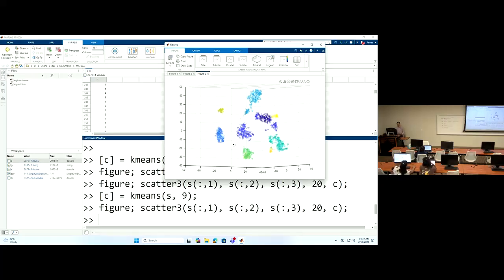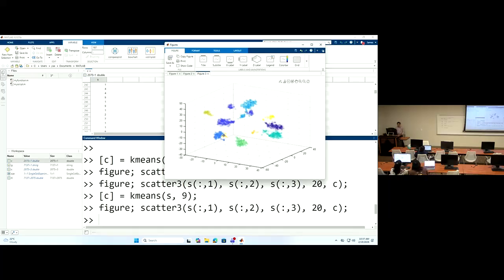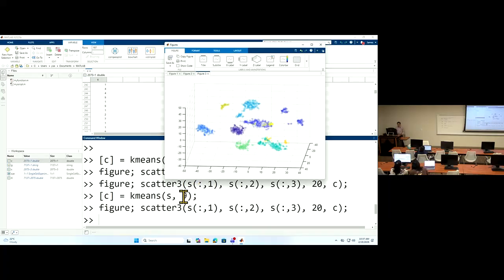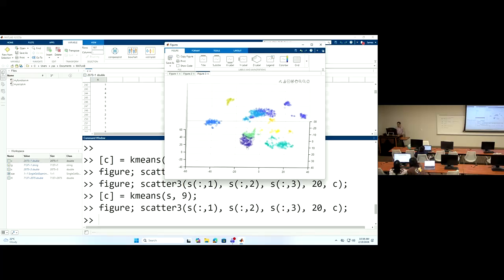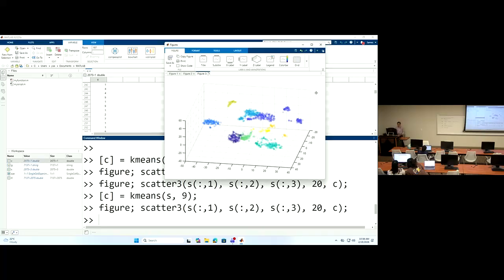So there's no best solution, and I don't believe we have an optimized number here. It depends on how you understand your data. You may want to still group this tail cluster as it is, or you may want to further break it down into 1, 2, 3 subgroups.